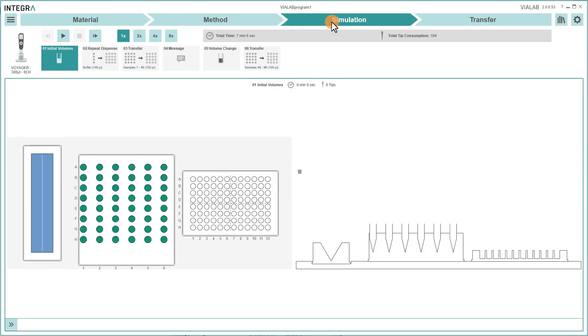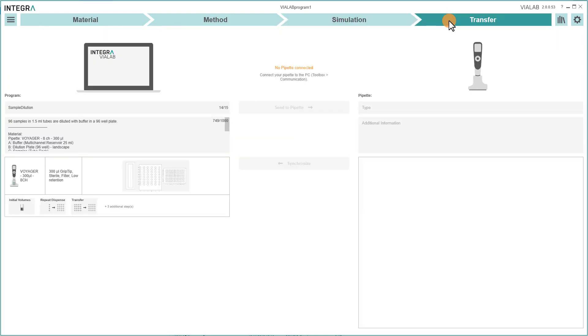With Simulation, you can watch a visualization of your program. And in the last section, Transfer, you can transfer your program to the pipet.